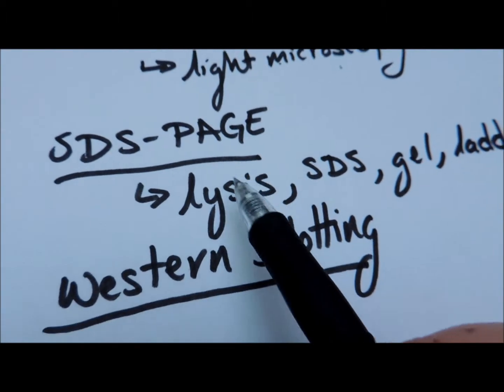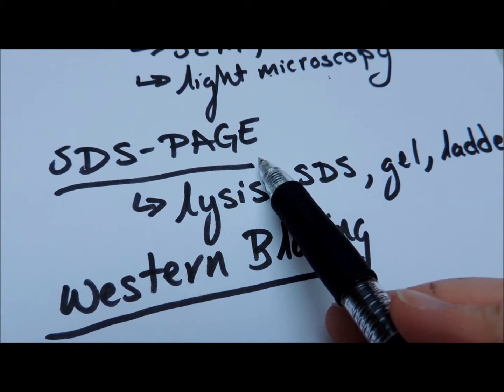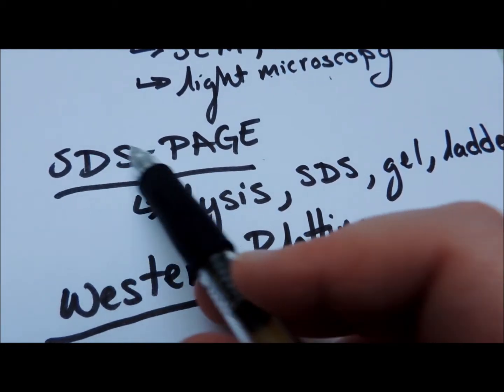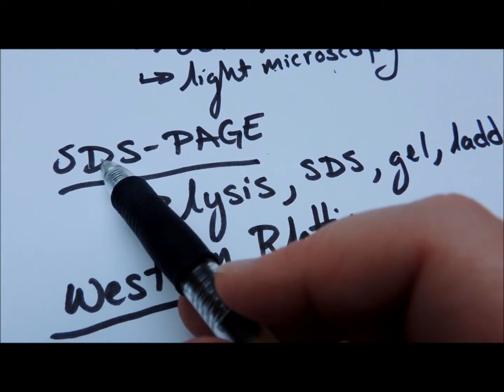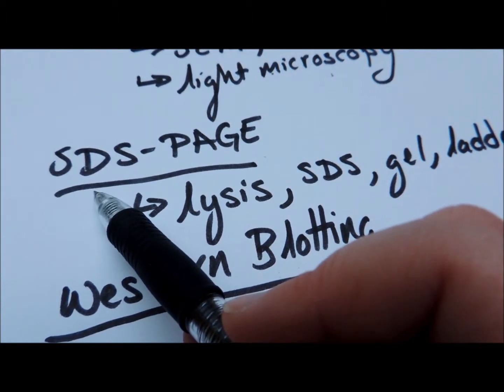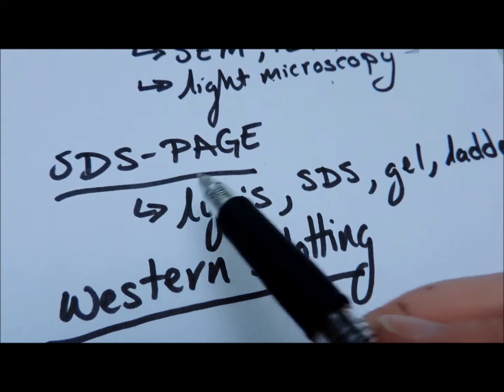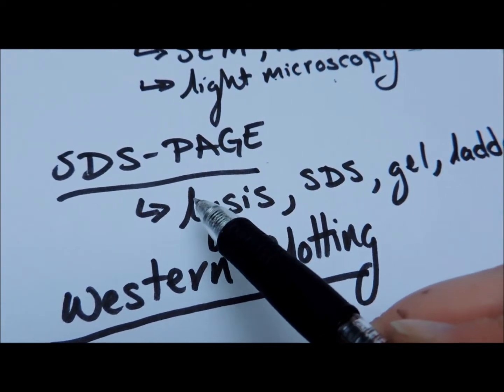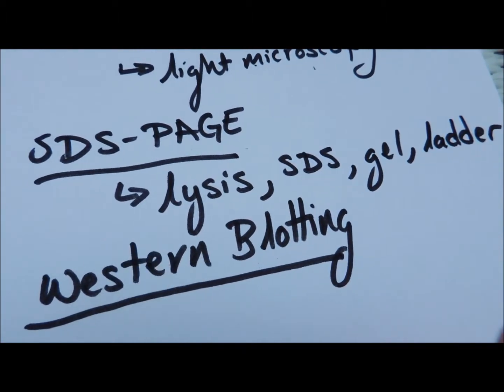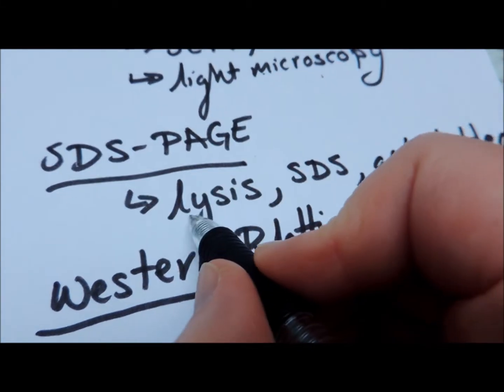Other things we've talked about as far as techniques you can use on small bio include SDS-PAGE. SDS is a chemical that will coat our proteins of interest with a negative charge and allow us to separate them on a polyacrylamide gel using an electrical charge, basically, so that the small proteins end up at the bottom of the gel, the large proteins lag behind.